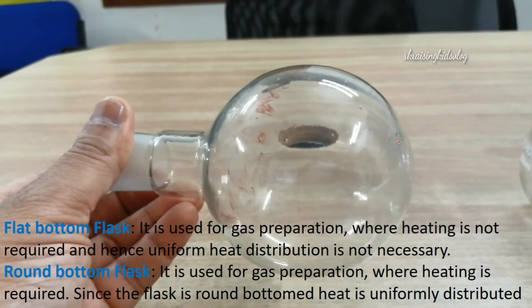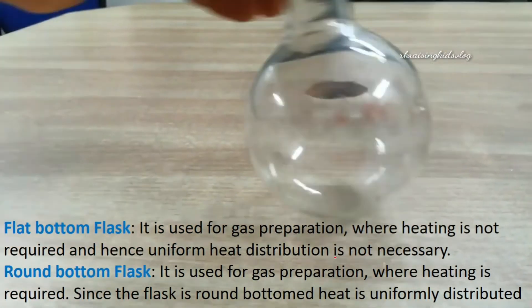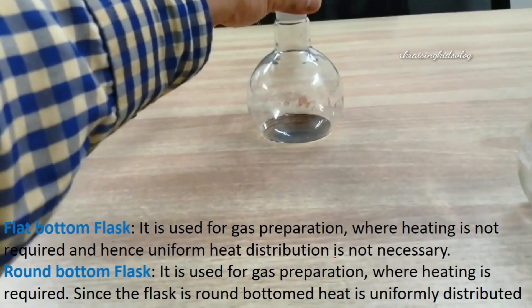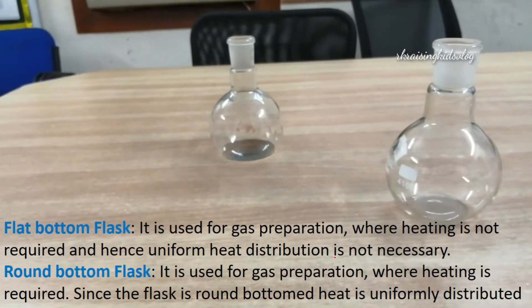See how round the bottom is — it's so round that it rolls. Because of this, it has to be supported by placing it in a hole in the table or using a stand.